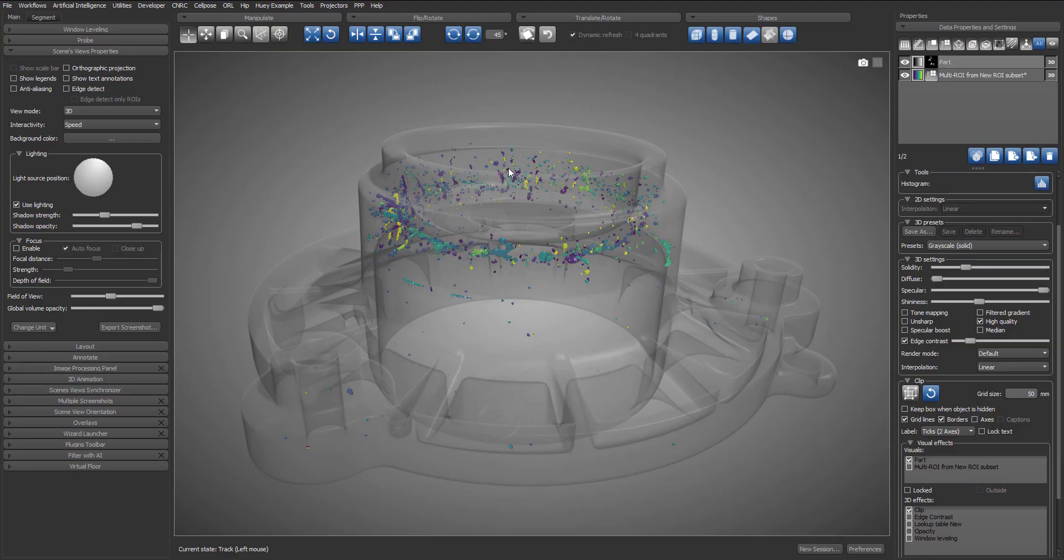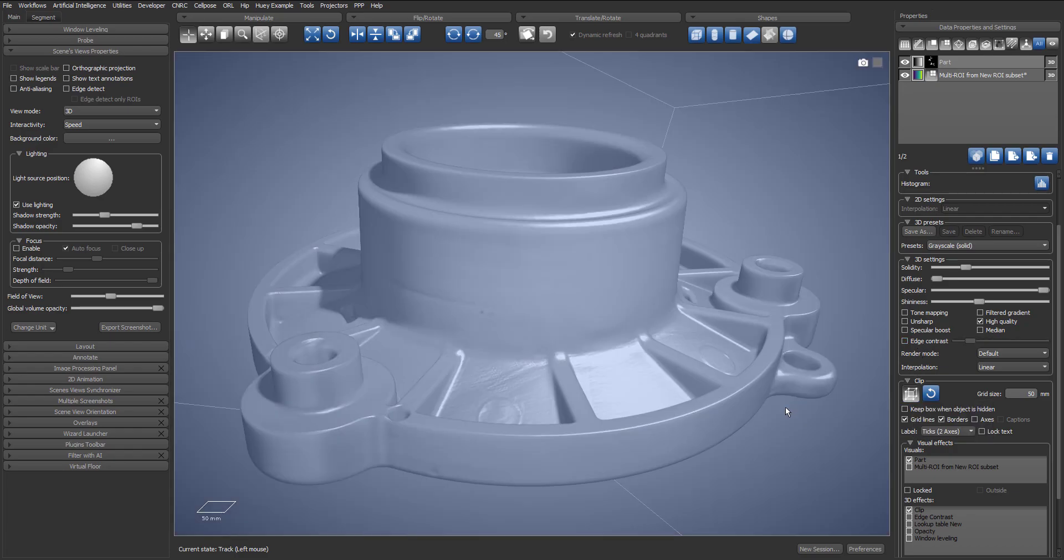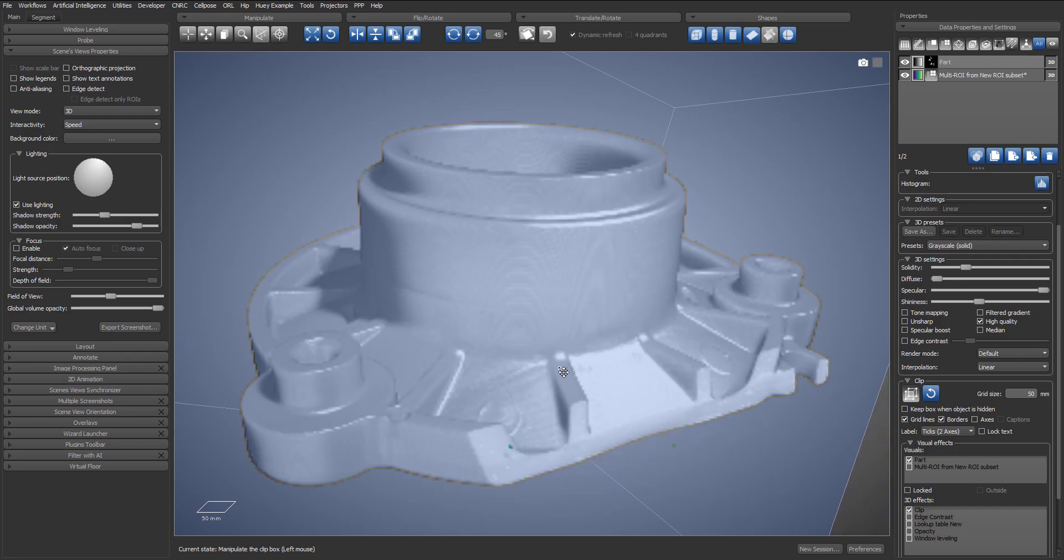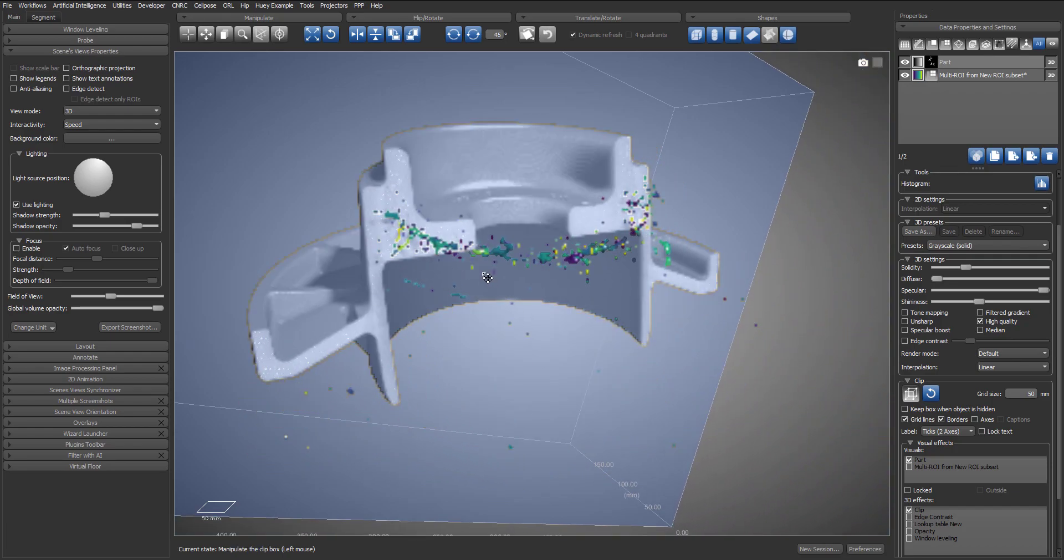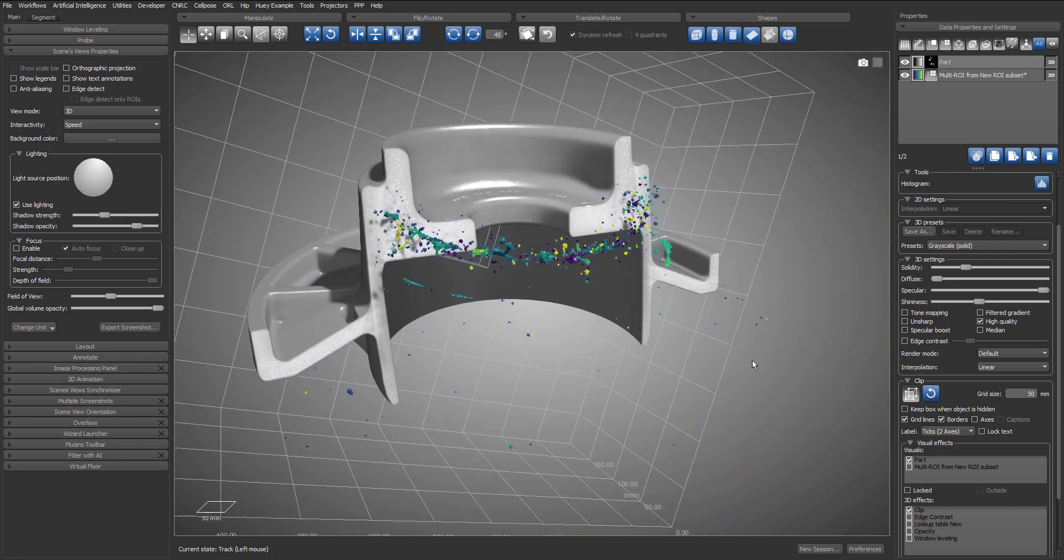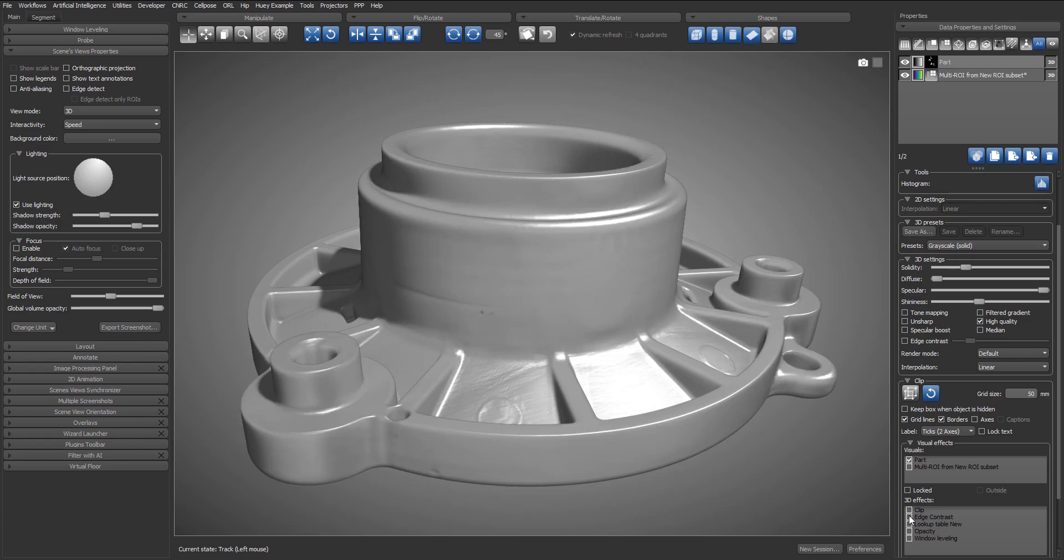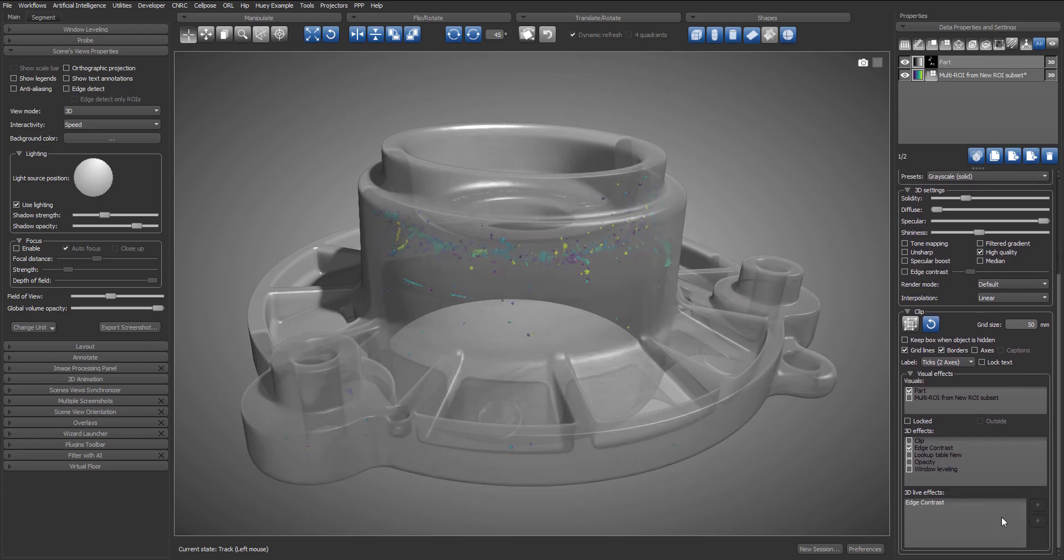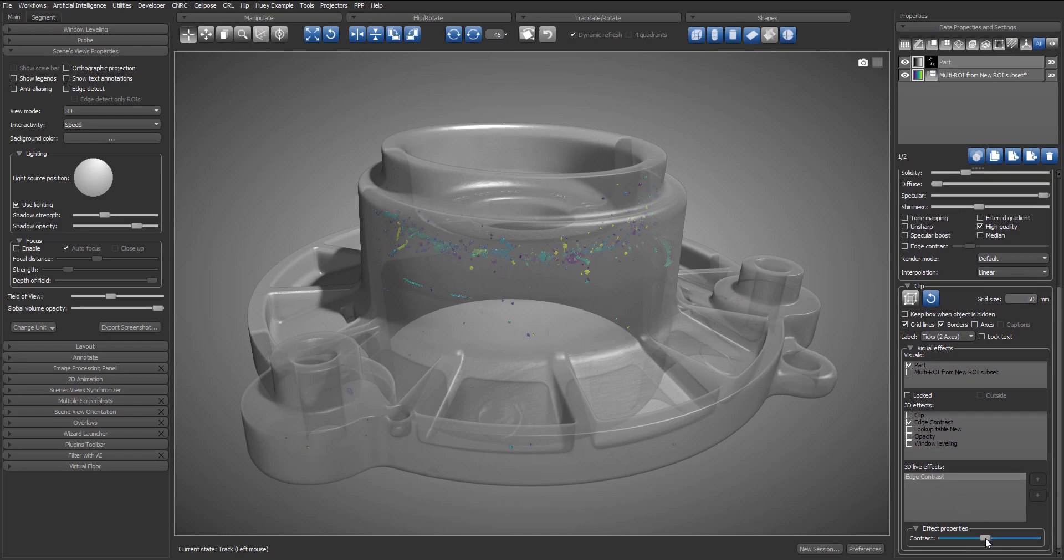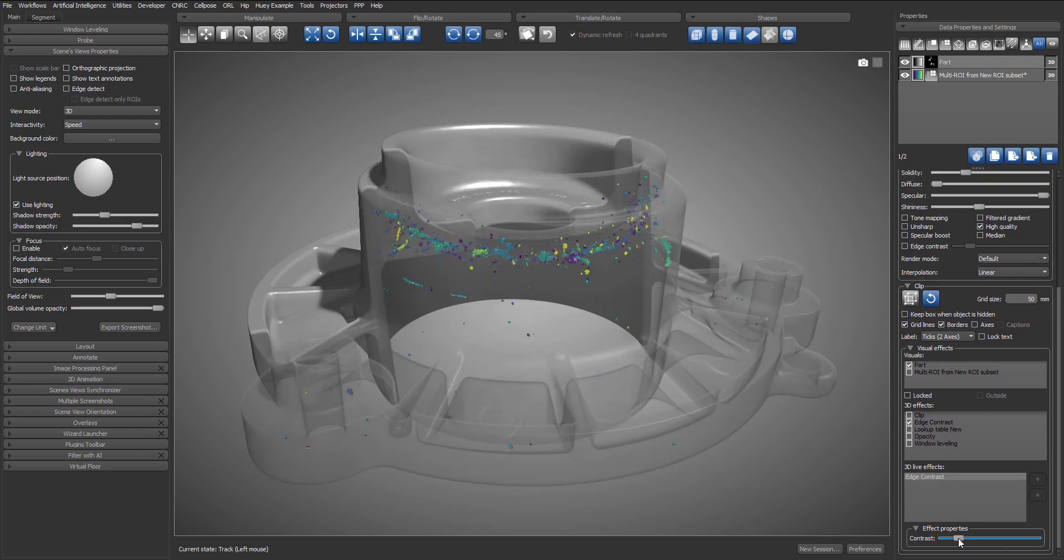It's possible to use the edge contrast effect on a sub-region of the dataset. So I will disable the global edge contrast effect. And in the clip panel, I will show the clip box and clip inside. And now instead of clipping what's outside, at the bottom of the clip panel, I can select from several visual effects. I will uncheck the clip and select edge contrast. And by selecting the edge contrast in the list of live effects, I can use the slider to adjust the threshold.